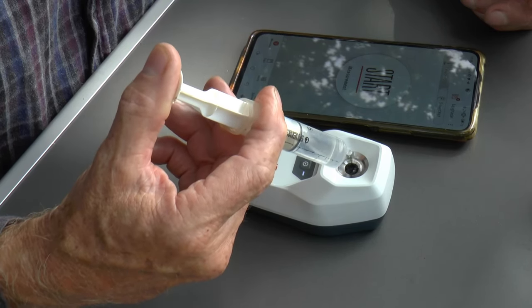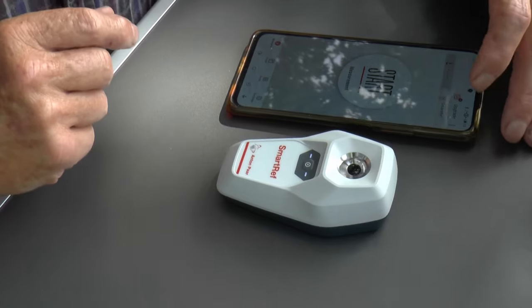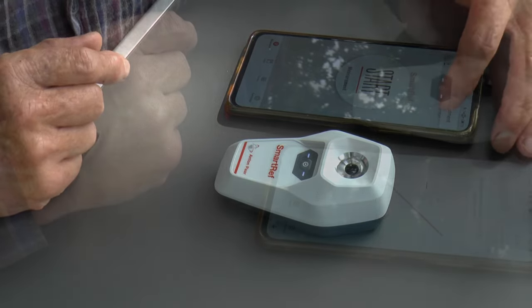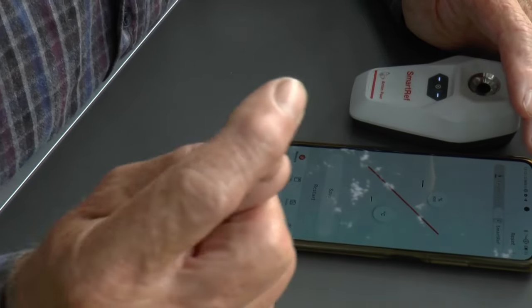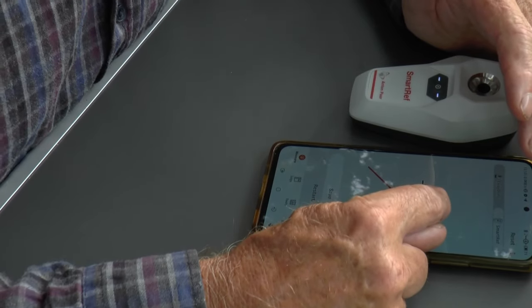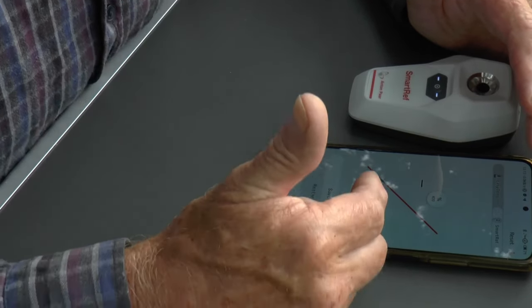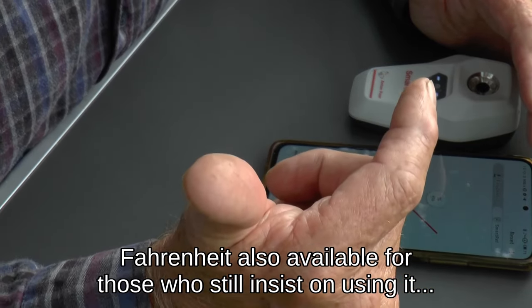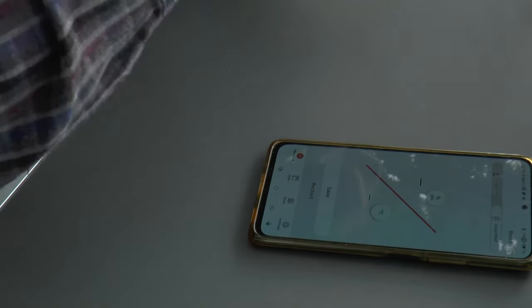Calibrating means you've got to zero it using distilled water. I'm going to add some distilled water to the sampling well — you fill it up to the line that goes around the well. Then in the top right-hand corner there are three little dots and it says 'zero adjustment' — I'm going to hit that. It says the adjustment was successful, so it's set to zero and it's ready to take measurements. It's reading degrees Celsius, measuring from a zero point. I'm going to get rid of this water and dry it again.